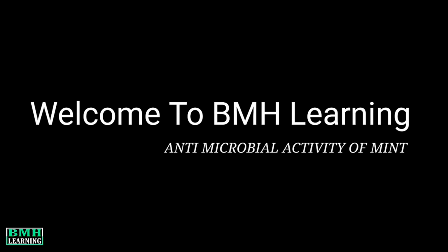In this video, I'm gonna talk about antimicrobial activity of mint. So, mint exhibits antimicrobial properties. The question is, how can we prove it or how can we check it? So we have a technique for that.